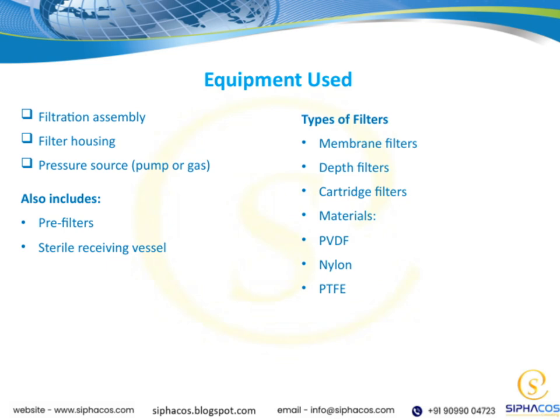Moving on to materials, the most common choices include PVDF, or polyvinylidene fluoride, known for its chemical resistance and durability, nylon, which offers excellent strength and biocompatibility, and PTFE, or polytetrafluoroethylene, which is highly resistant to chemicals and heat.